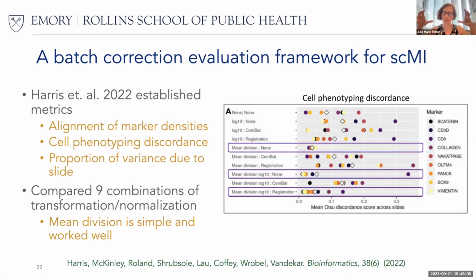Since you're actually breaking a tissue sample up into many small individual images, I would imagine that certain images have more or fewer of certain types of cells, right? My biological understanding here is not great, but different types of proteins would be more prevalent in certain images. Would that affect the normalization? Because you might expect higher intensities in certain images than in others, depending on the composition of cells.